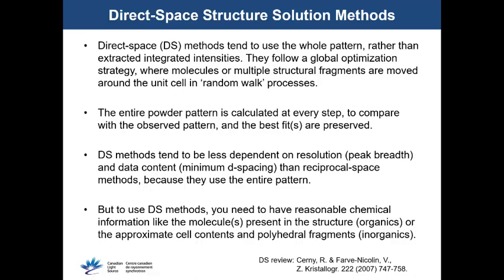This can require model building if you're looking at a molecule that hasn't been observed in a crystal structure before. A big advantage of these direct space methods is that they can be successful with lower quality data and with less data content than reciprocal space methods. So you can get by more easily with lab data and with poorer resolution.